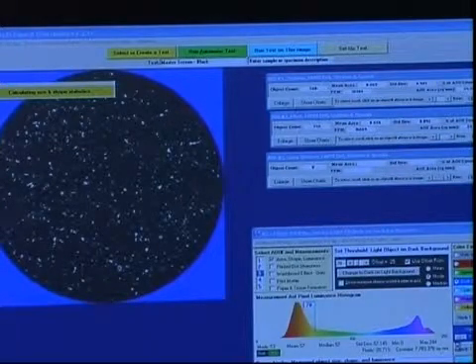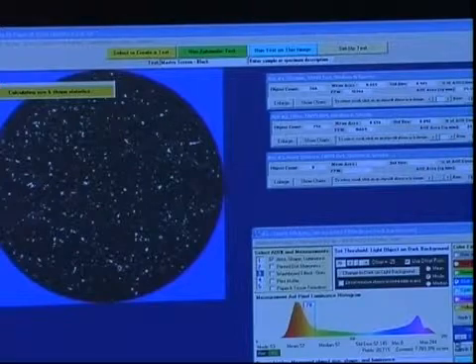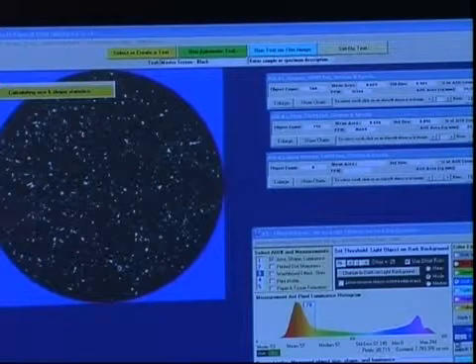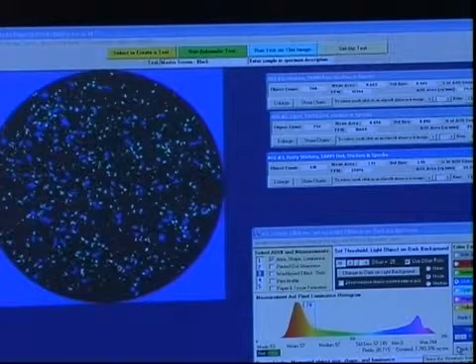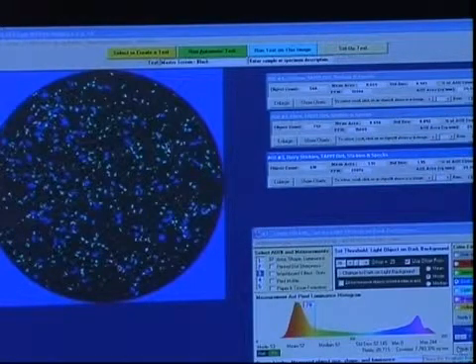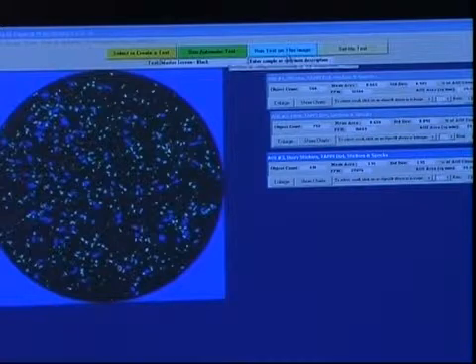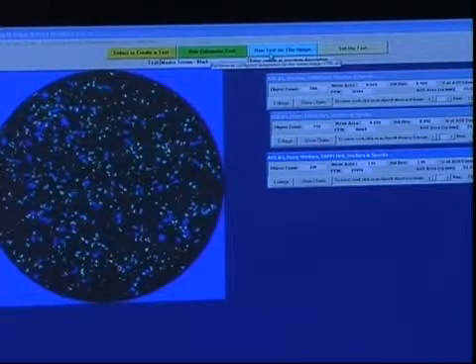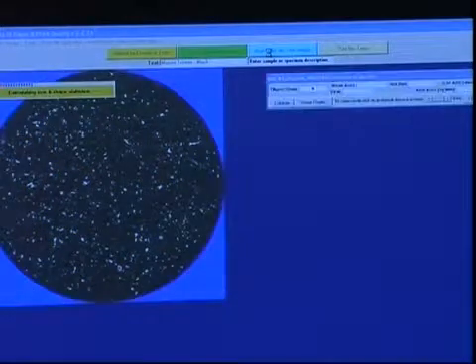Now, anytime you may not be interested in this level of sophistication, you can use the dirt counter just to count the white stickies and not count anything else. But this one allows you to do, as I said, up to five different ones. We're only doing three. Here you see the entire report. I'll run the test on this image, meaning I can test the configuration that I have just made on the image that I have present at the time. Now it's going through all three tests automatically.